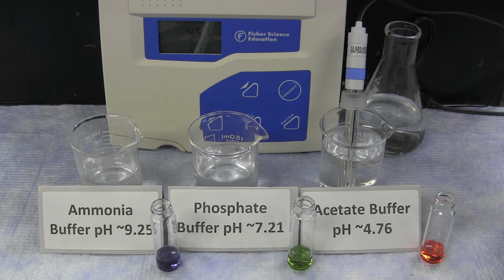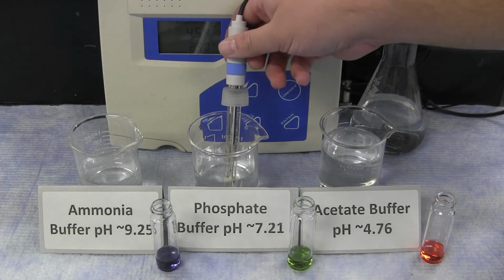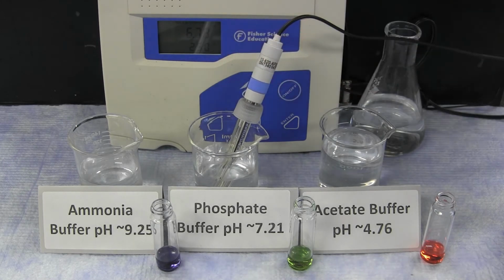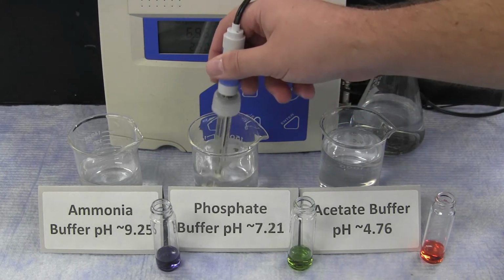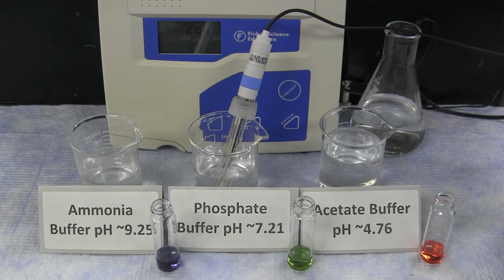This particular buffer solution of acetate buffer is at a pH of 4.56. The phosphate buffer solution is prepared at an approximate pH, or at a more specific pH, of 6.93.